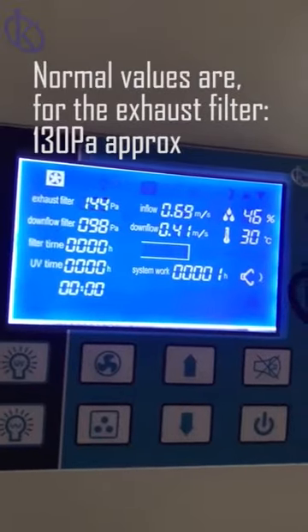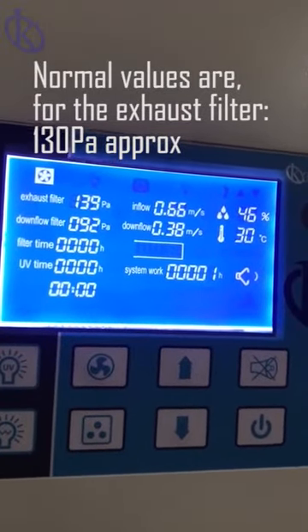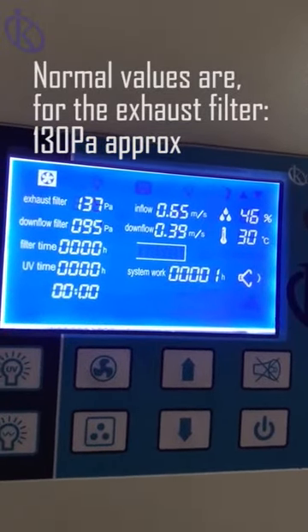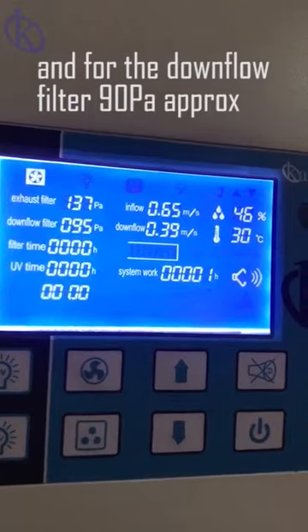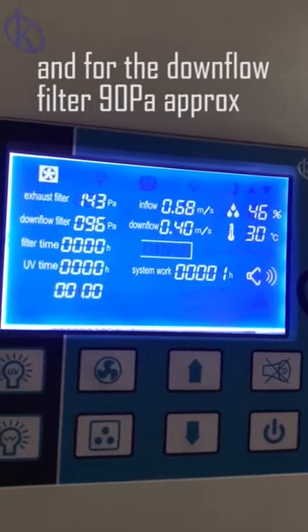Normal values are: for the exhaust filter, approximately 130 Pa, and for the downflow filter, approximately 90 Pa.